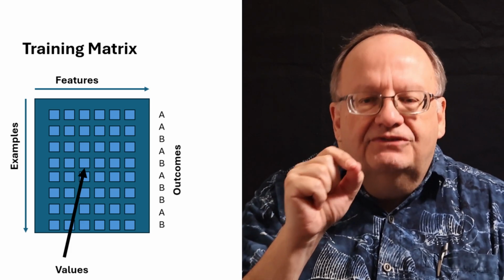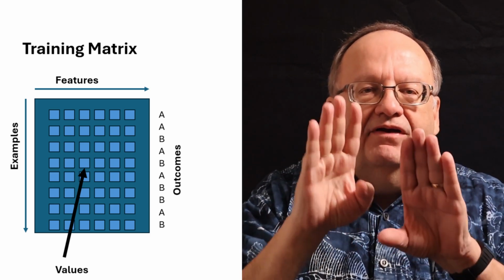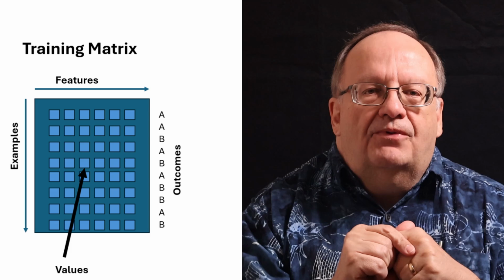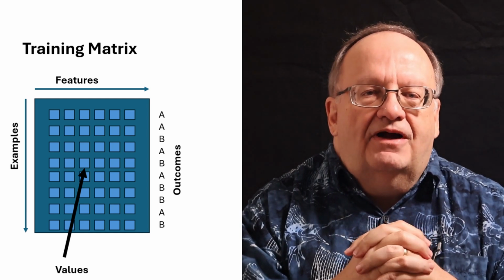And then the outcomes, as we've talked about in other videos, we'll continue to talk about, we're doing A-B comparison. We're comparing two sets of examples because that's going to help us focus on our particular biochemical problem. So for every example, we're going to give it an outcome from one of the two possibilities that we've identified for our problem.